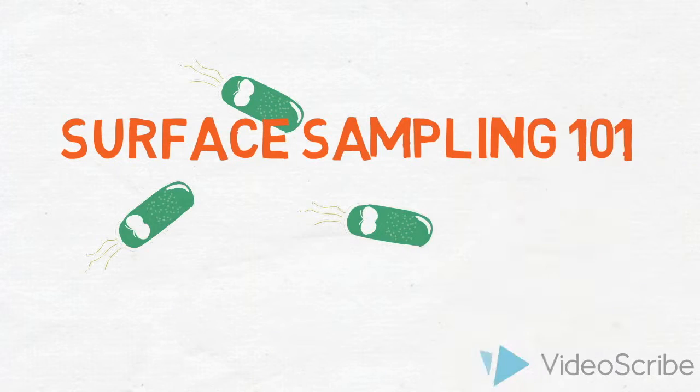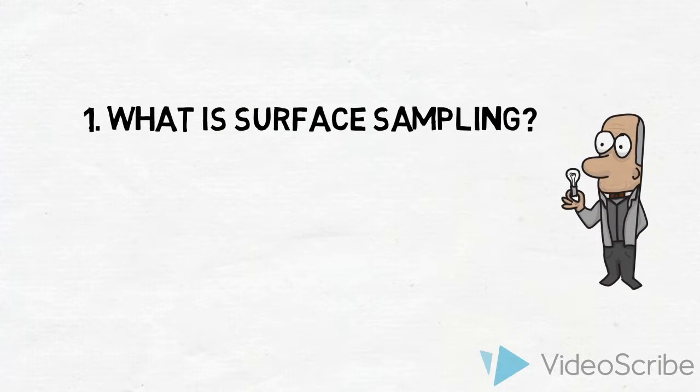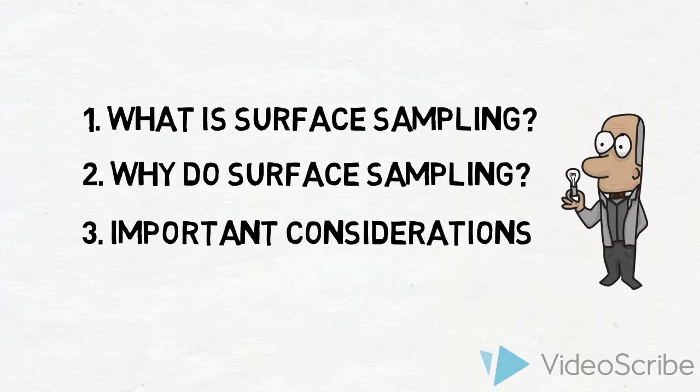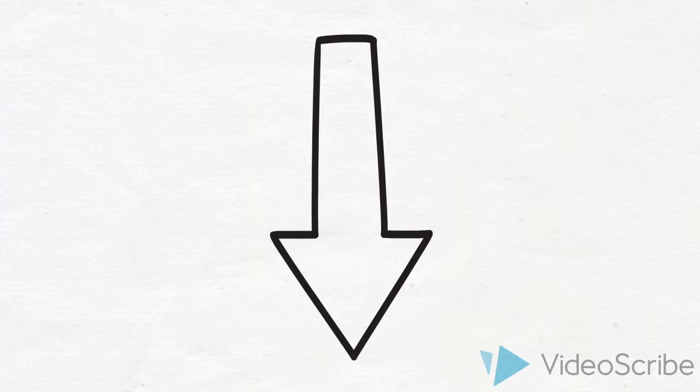Welcome to our short video presentation on surface sampling. In these 5 minutes, we'll be first talking about why we carry out surface sampling, followed by the considerations for carrying out surface sampling, and lastly, how each surface sampling method compares to each other. Without further ado, let's dive in.